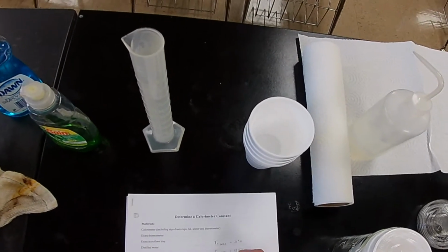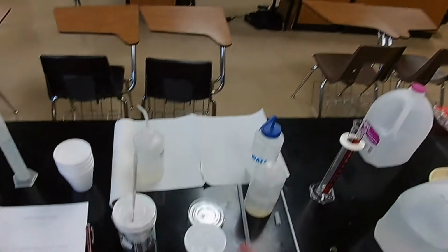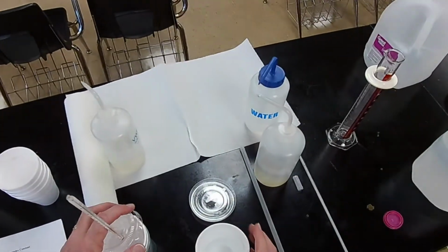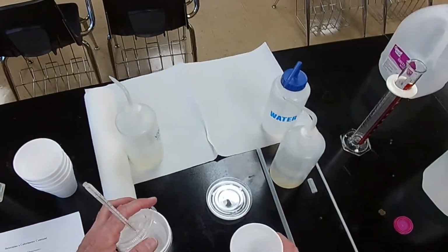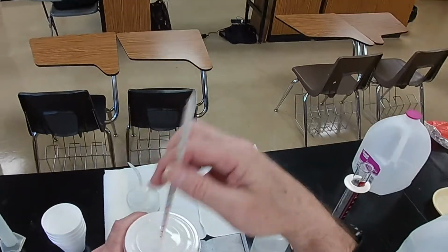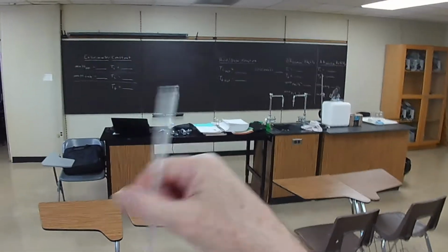And the final temperature, the final temperature is the same for both of them because they're combined, they're in the device. So we open up the lid and we pour the water in and stir. And we also watch because we want the maximum temperature that's obtained. It's still going up.